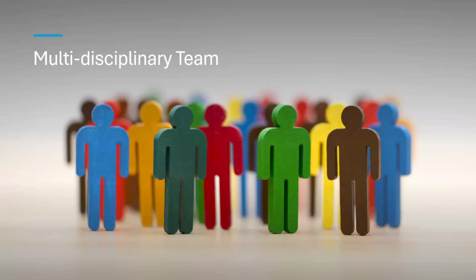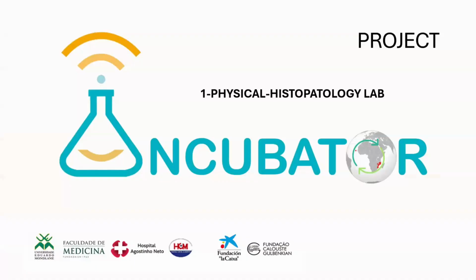To implement the Incubator project, firstly, we implemented the physical histopathology lab. This is the first histopathology lab in Cabo Verde, at the University of Cabo Verde.